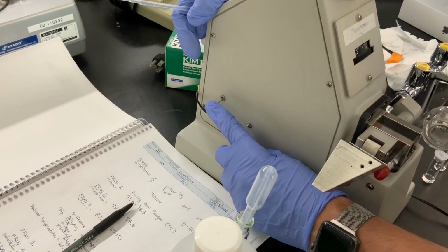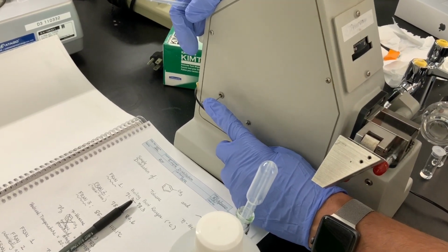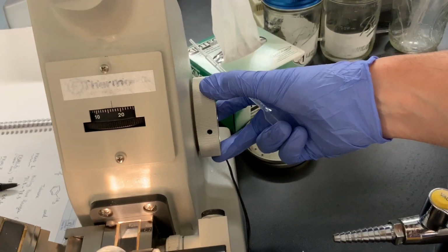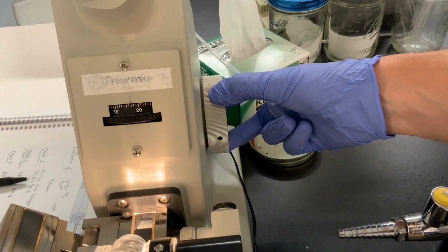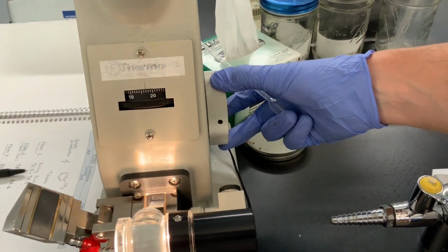If you depress it once more, you then get that vernier scale to actually read the refractive index. On the other side of the instrument is this dial that I used to get that dark level, give us a half moon, and hit that crosshairs exactly.